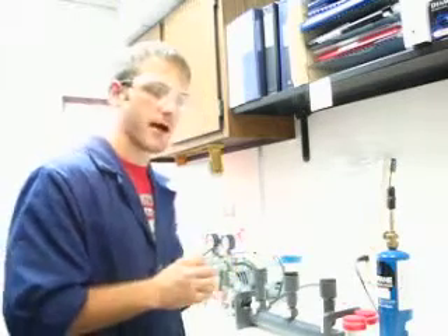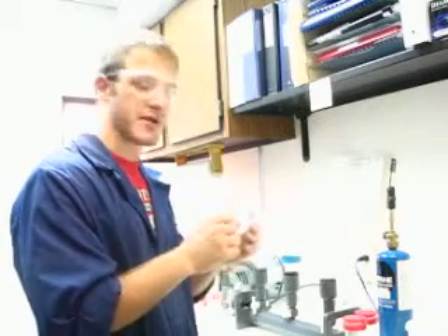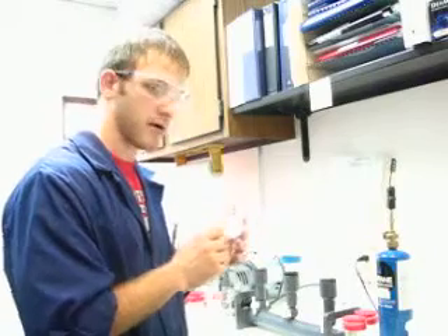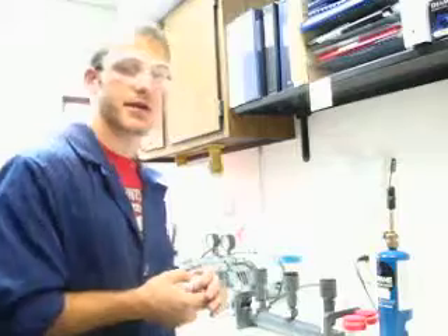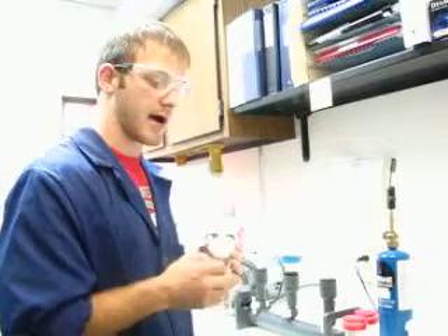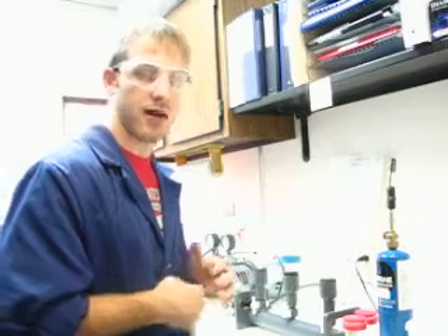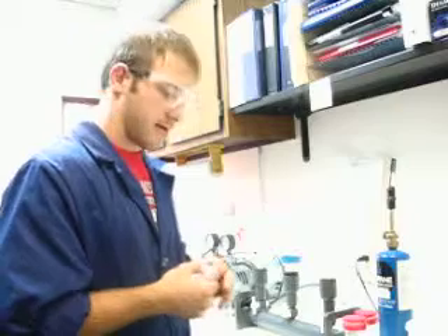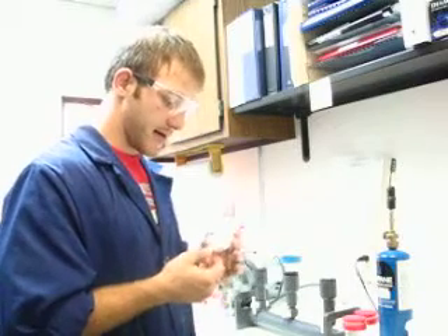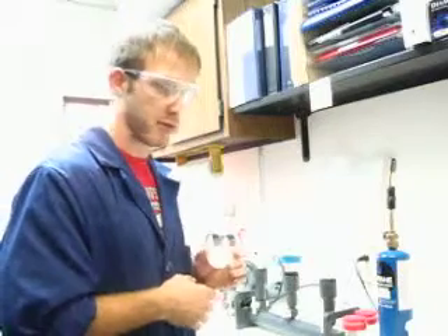Now tomorrow, at around this time, I will check this, and I will view this grid, and I will count the number of blue colonies on the grid. And with that, I will plug into an equation, and I will come up with a number indicating colony forming units in that amount of sample. And that is how you test for fecal coliform bacteria in a water sample.